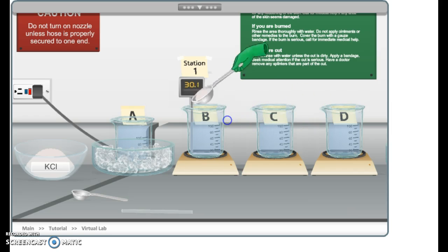I don't have to keep doing it one at a time because I know when it was colder, 6 scoops dissolved. So now that it's warmer, the molecules are moving faster, there are more collisions. I know that I'm going to be able to dissolve at least 6 scoops or 30 grams. And so I can put 6 in and stir it, and woohoo, it's all gone. And then I can keep going from there. So you can use that for this set of beakers, okay?